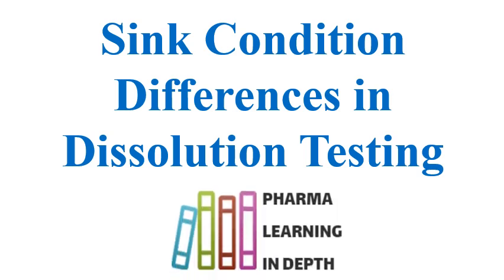Then another point I want to include here is strength-specific dissolution specifications. You can give some specifications for lower strength. The specification will differ for the medium strength, and the higher strength will have a different dissolution specification than the middle and lower strength.